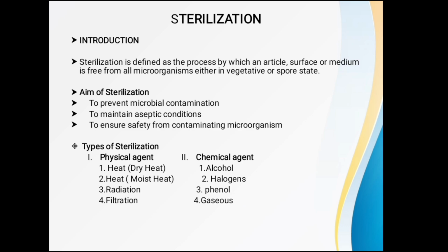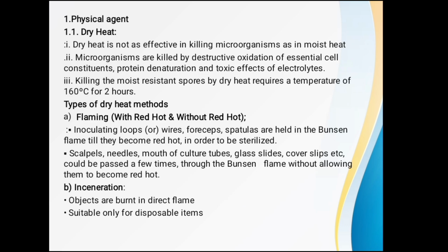There are two types of sterilization. One is physical agent, another one is chemical agent. Physical agent: heat, dry heat and moist heat, radiation, filtration. And chemical agent: alcohol, halogens, phenol and gases. First of all, physical agent.